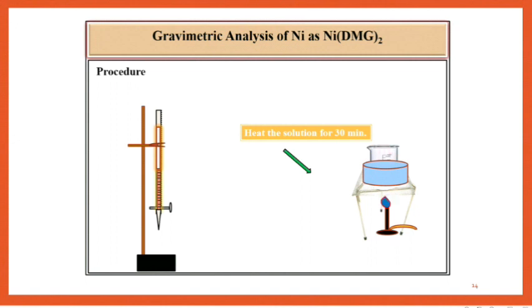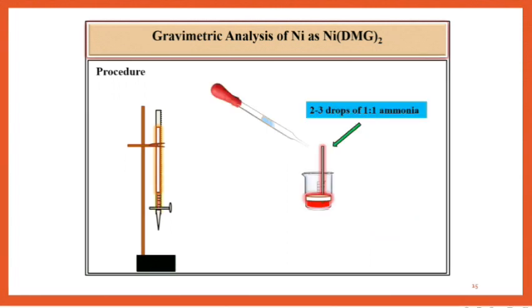Then allow the precipitate to settle down. Test the completion of the precipitation by adding few drops of 1:1 ammonia solution and DMG reagent to the supernatant solution. It should not give any precipitate. If it is giving then add little reagent solution till finally no precipitate is obtained.